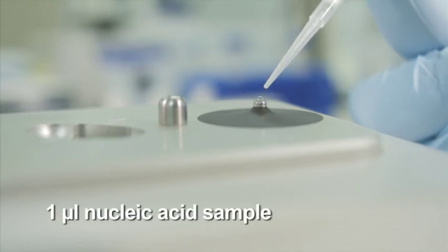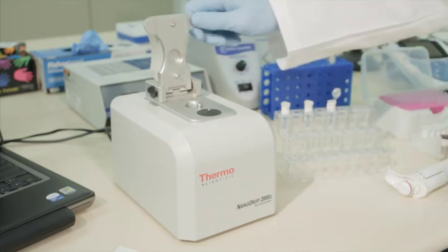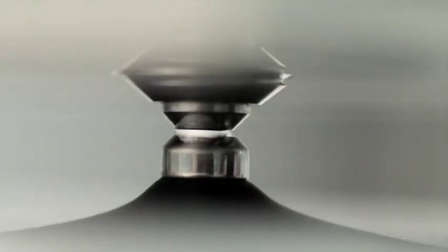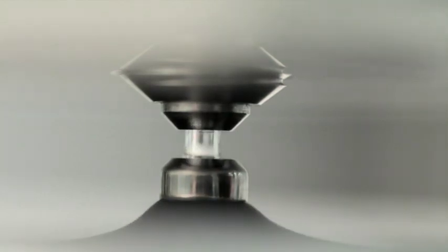Next, dispense 1 microliter of nucleic acid sample onto the lower optical pedestal and close the lever arm. Because the measurement is volume independent, the sample only needs to bridge the gap between the two optical surfaces for a measurement to be made.